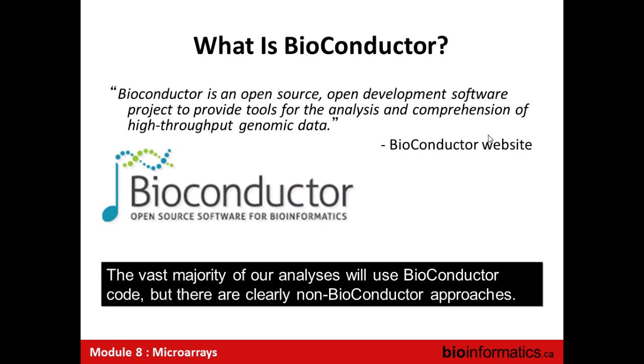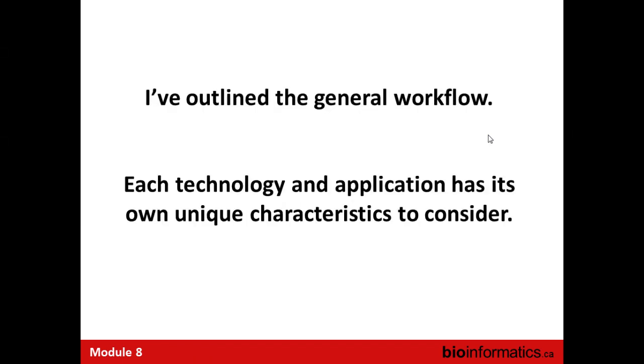And so for years, you could be buying this, saying, "I am doing RMA just as everybody tells me I should," and get numerically wrong answers. Bioconductor has a huge advantage because the people who are developing it use it every day. So if there's a bug, they're going to go to their grad student or their programmer and fix this, or else all of the analyses we do are going to be incorrect. And because they're doing analysis all the time, these changes happen very rapidly. So there's a big advantage there to the open source software over the commercial software in terms of the up-to-datedness and correctness of the analyses.